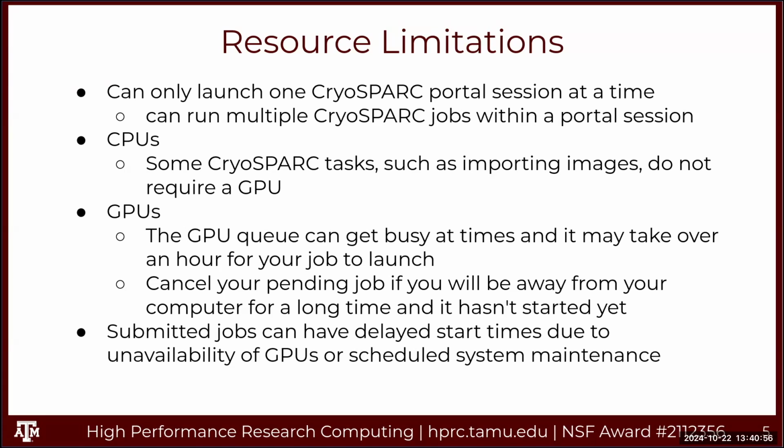Some tasks do not require GPU. CryoSPARC will let you know if it requires GPU for that task. And GPUs can get busy at times, and again, cancel your job if you're going to be away for a long time. You don't want to leave a pending job and go to sleep and then come in the next morning and it's been sitting idle for 8 hours or however long you sleep. Submitting jobs, there can be a delayed start time due to unavailability, or we may have a scheduled maintenance, and we'll show you how to check whether there is a maintenance scheduled.